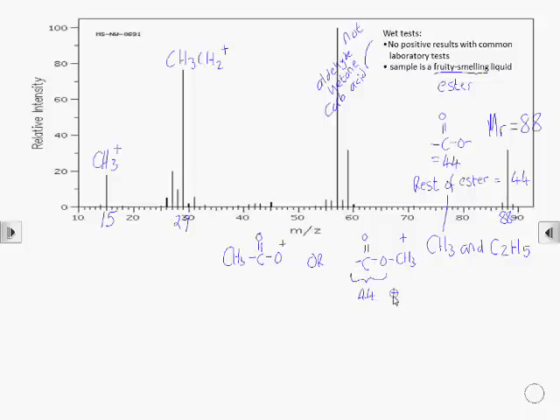So that's going to be a peak at 59 if that's one of the fragments. And there it is in the spectrum. We can assign that peak to either CH3COO or COOCH3. We don't know yet which way round that's going to be.